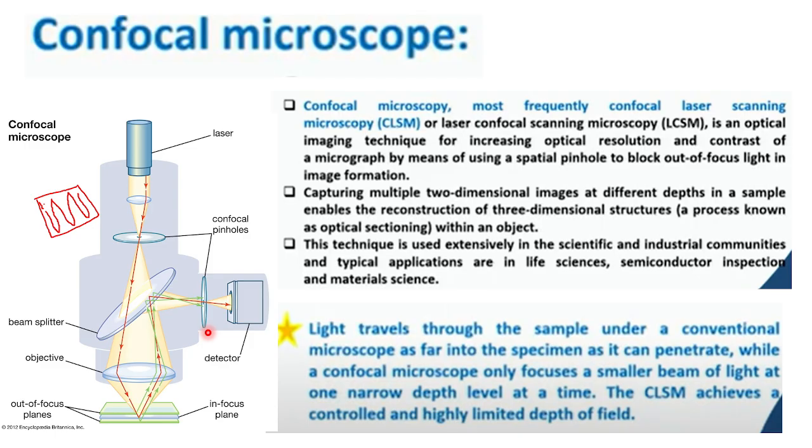And why will the scattering be higher? Because of the optical density: if any composite or material or heavy element is present, the scattering will be high. Is it clear now why I need another pinhole here? Just to reduce the scattering that happens after the incident light is reflected. The scattering will be higher if there is a heavy element or different phase. To reduce that, because I need a high contrast image, I need less scattered reflected light.